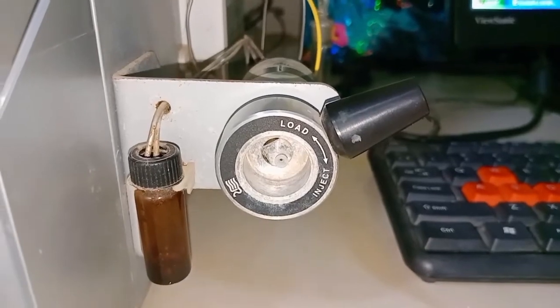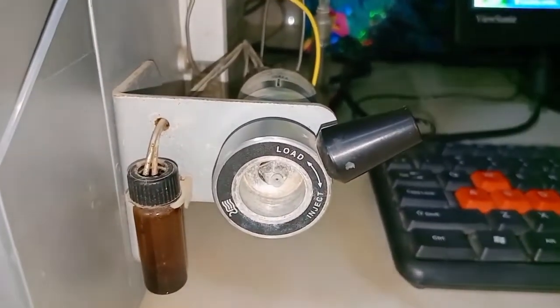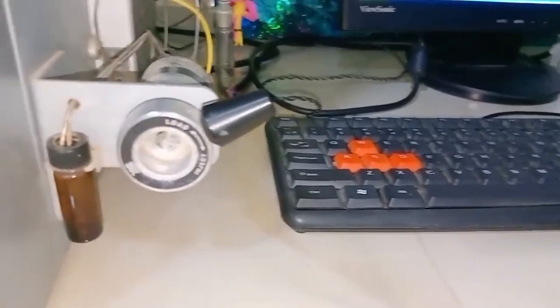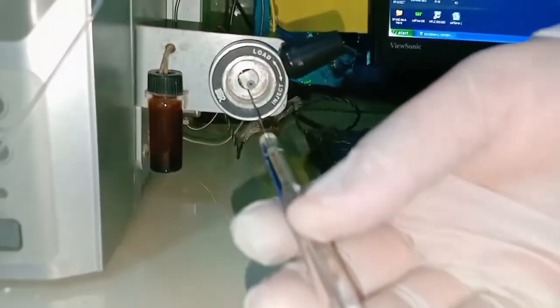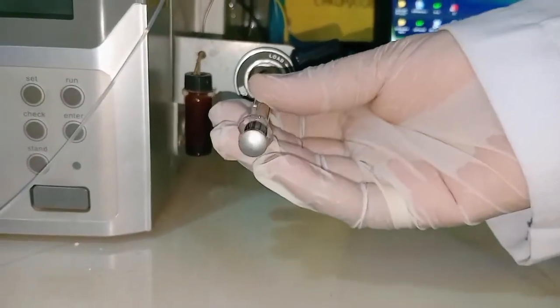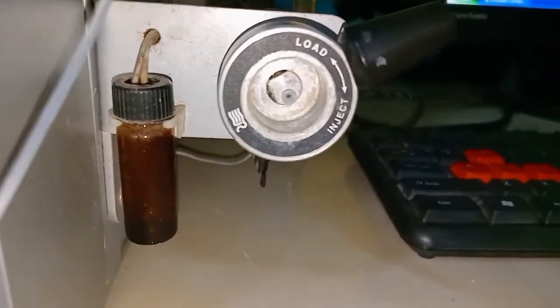The third component of the HPLC is the sample injection system. Here we have the manual injection system, in which the sample is injected through the Hamilton syringe. This is the Hamilton syringe. Through this Hamilton syringe, you can inject the sample into the septum of the injector. The capacity or the volume of the sample injection is 20 microliters.